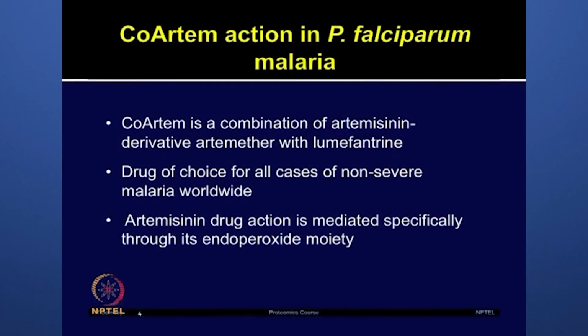In this paper, authors have discussed how two different drugs which are effective as antimalarials can be studied for looking at the proteome changes in the Plasmodium falciparum parasite.